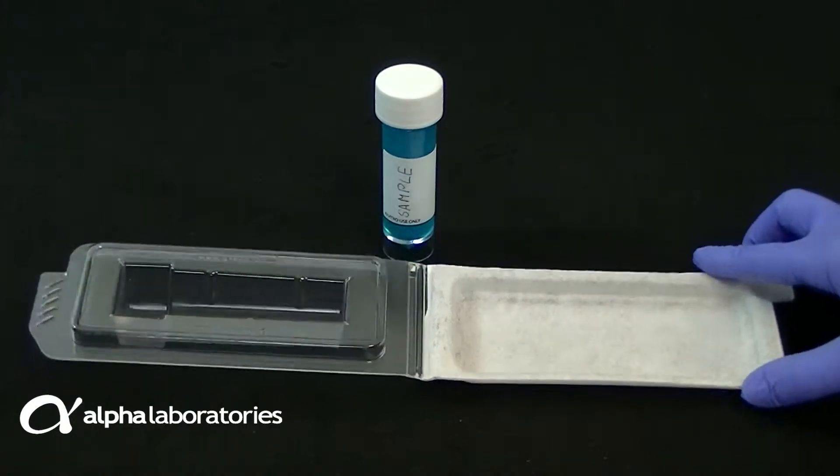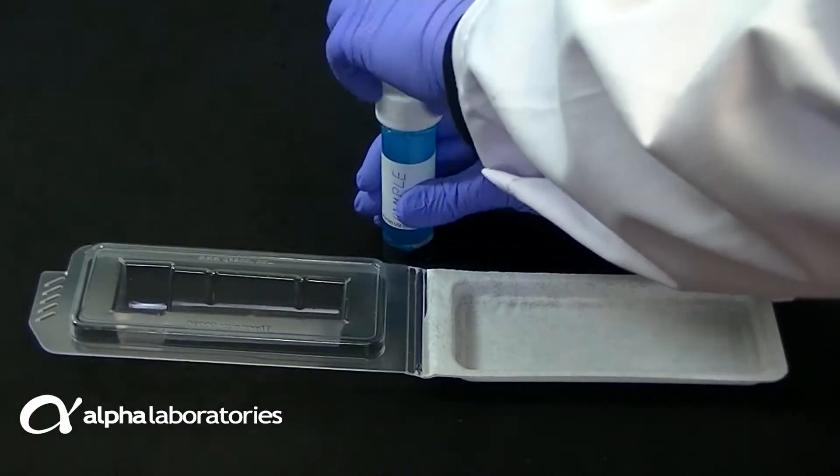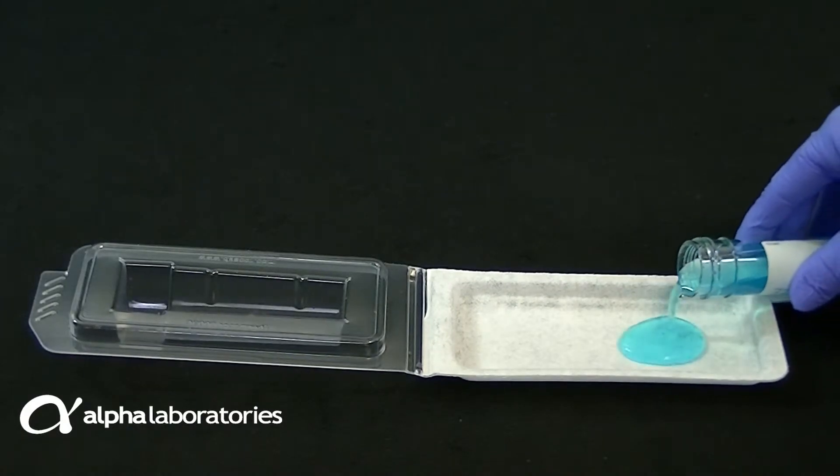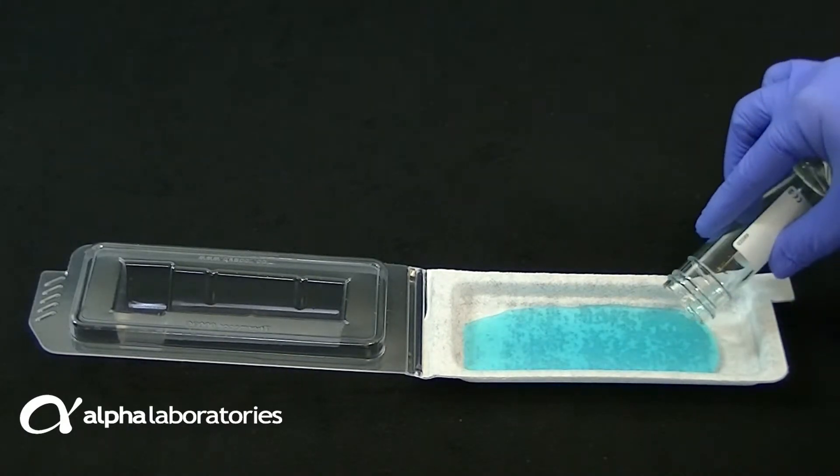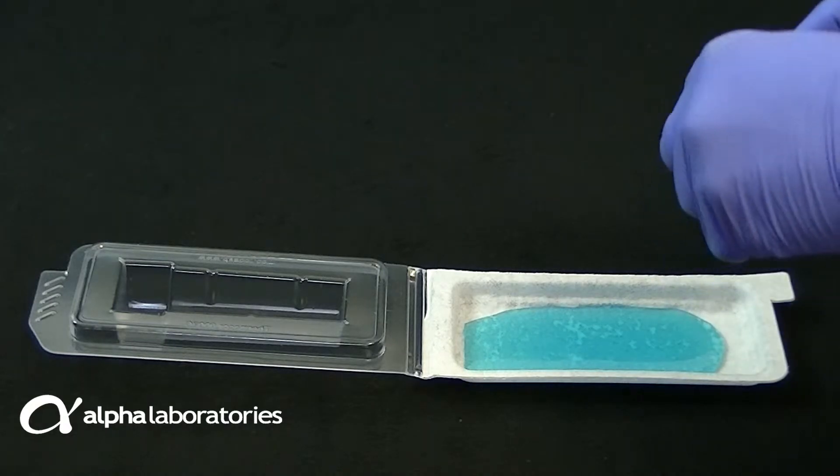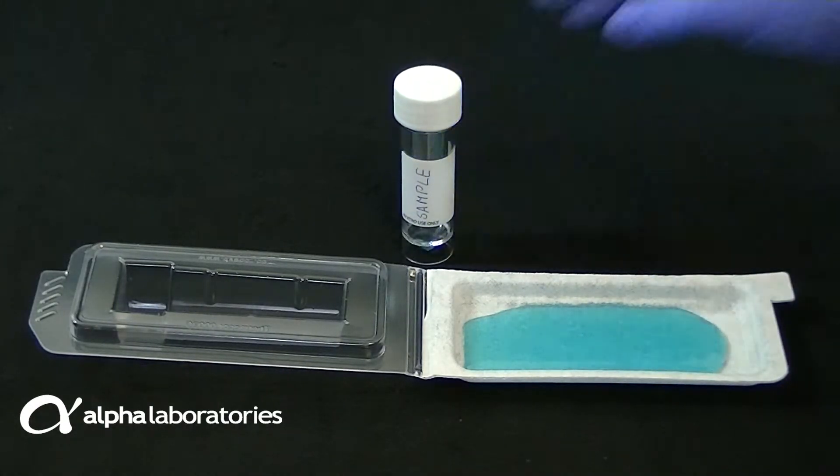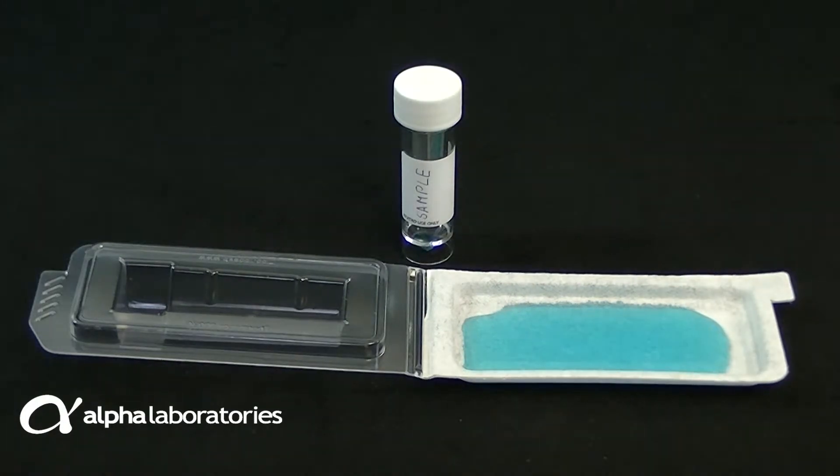The bonded internal lining is made from an ultra-absorbent gel base which prevents any leaks. The gel is so absorbent that 1m2 can soak up as much as 20 litres of liquid.